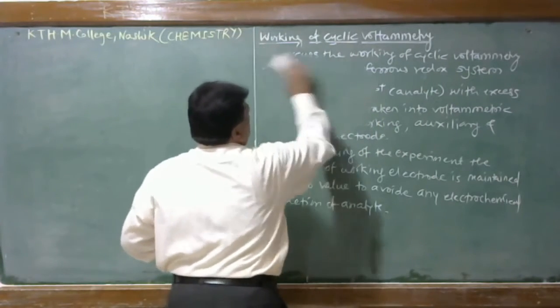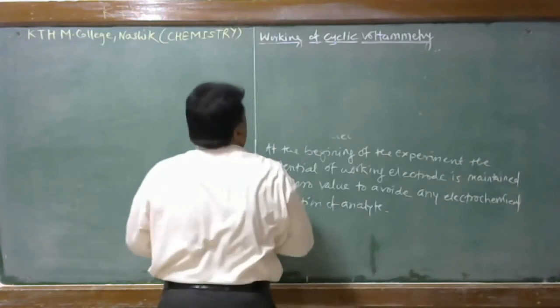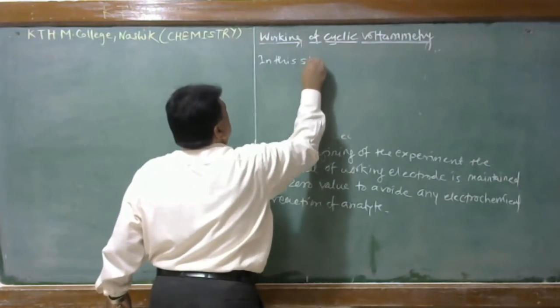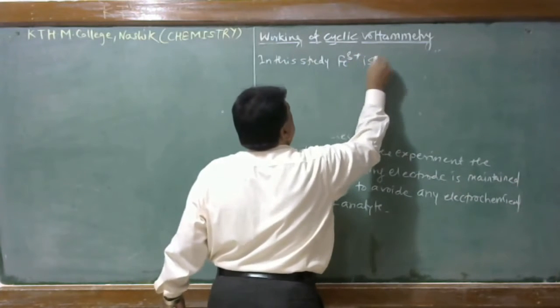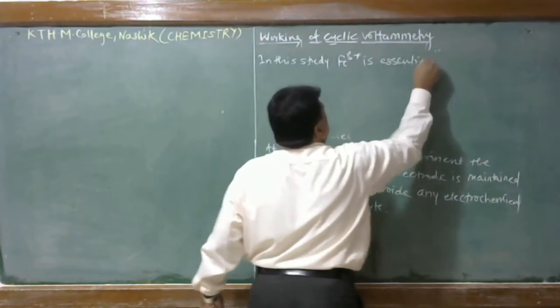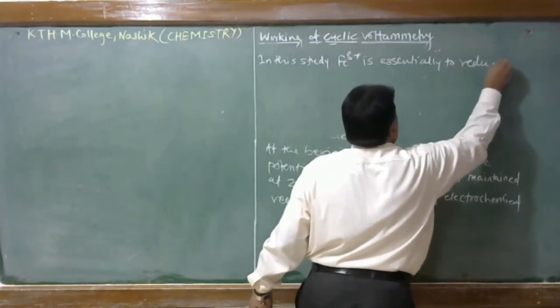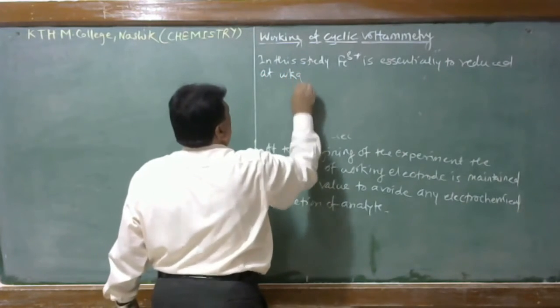In this study, Fe3 plus is essentially to reduce at working electrode.